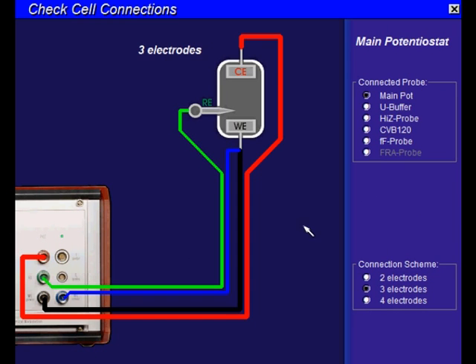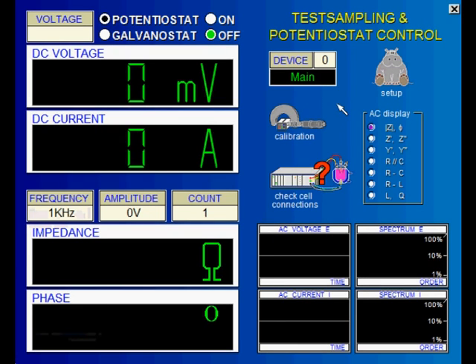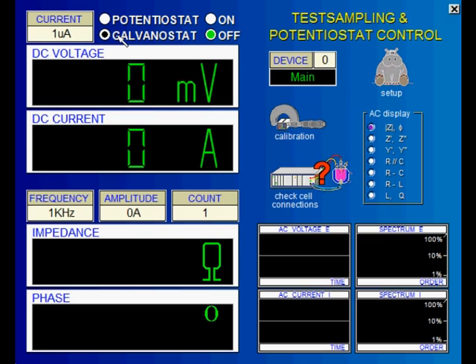Back to the control potentiostat page, we are selecting the operation mode. In potentiostat mode, the DC potential is controlled and the current is measured. In galvanostatic mode, the DC current is controlled and the potential is measured.